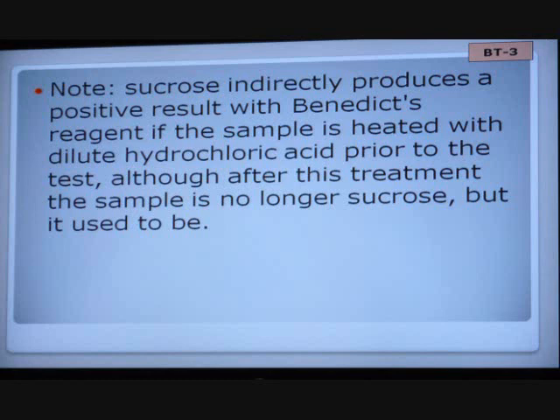Now, if it wasn't sucrose, if you put acid in plain old water, it's going to stay blue. That Benedict is blue. If it stays blue, that means it didn't find anything. If it turns colors, it means it found something. And the colors mean something because green is your weakest color. That means there's not much sugar here. A yellowish orange means there's a little more sugar here. And you get a real pretty brick red color, that means there's a lot of sugar in it.